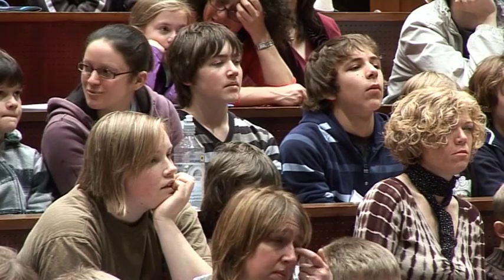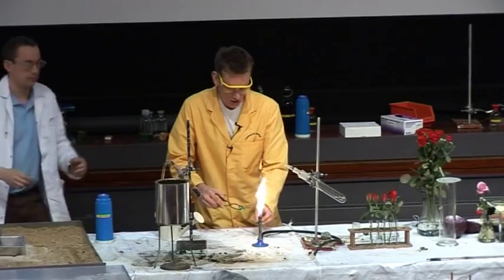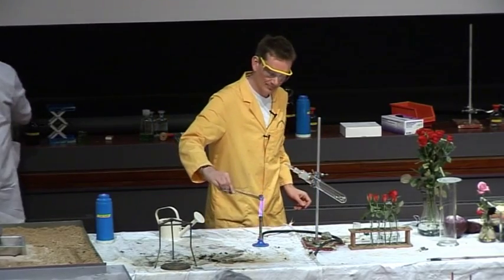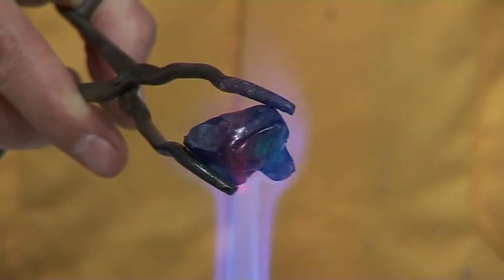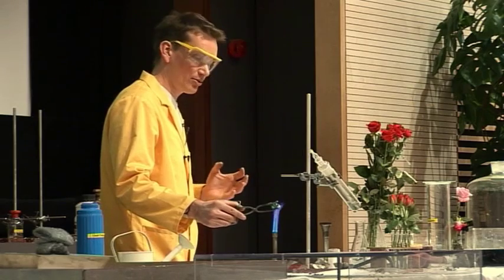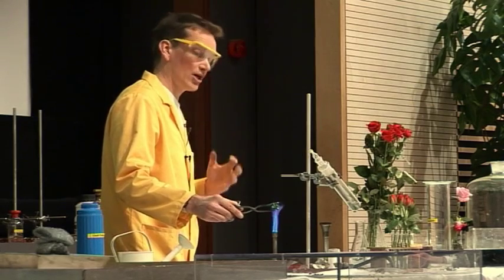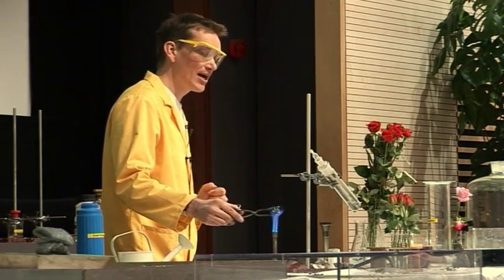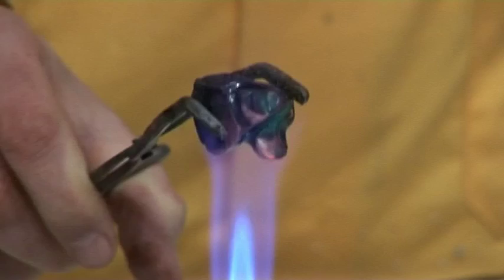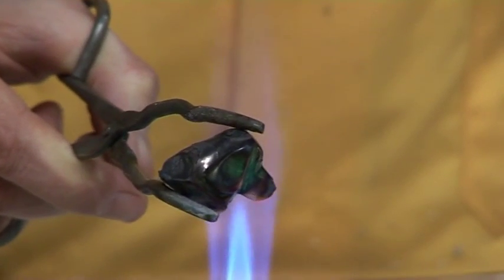And we're going to heat him up. Take Chip — at the moment he's this lovely green colour. But if I heat him up in the Bunsen here, the copper carbonate that he's made of is going to decompose. It gives out carbon dioxide gas and forms copper oxide. And we'll know when we're beginning to get some copper oxide because the copper oxide is black.